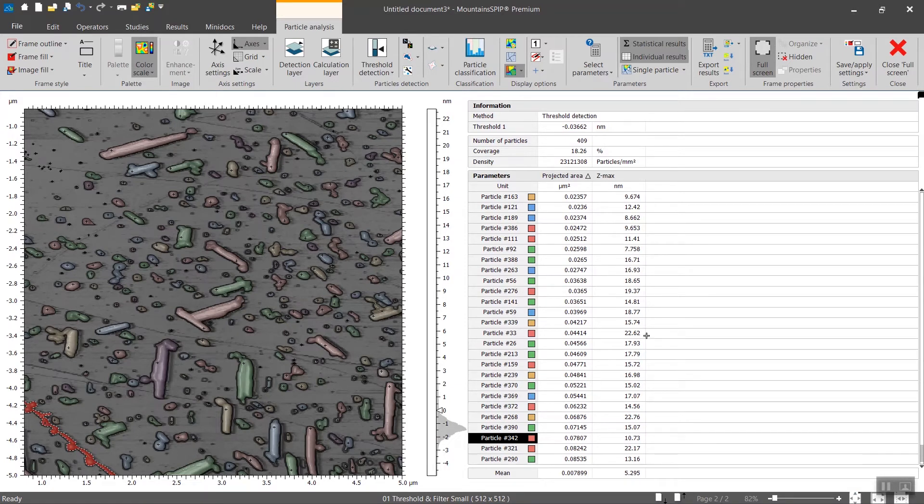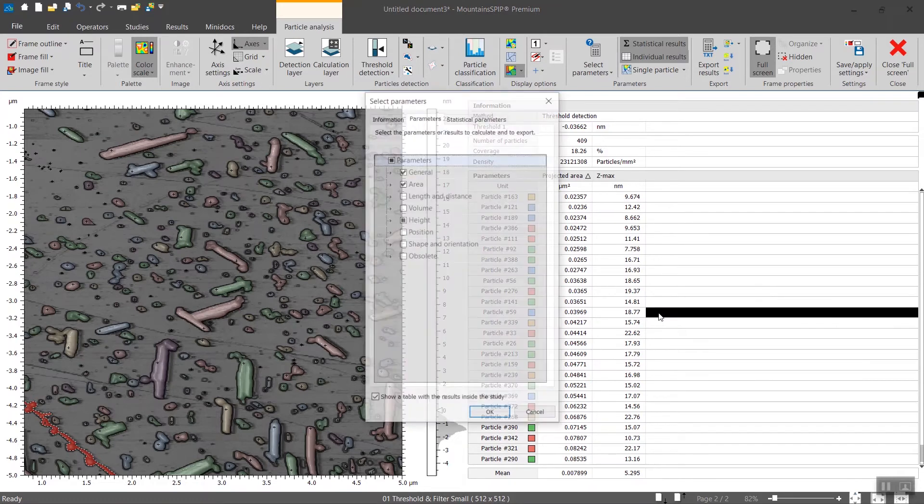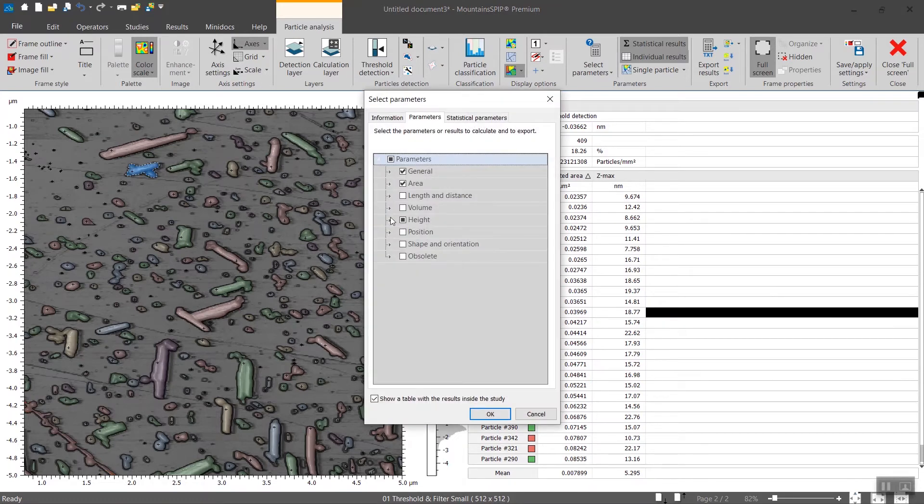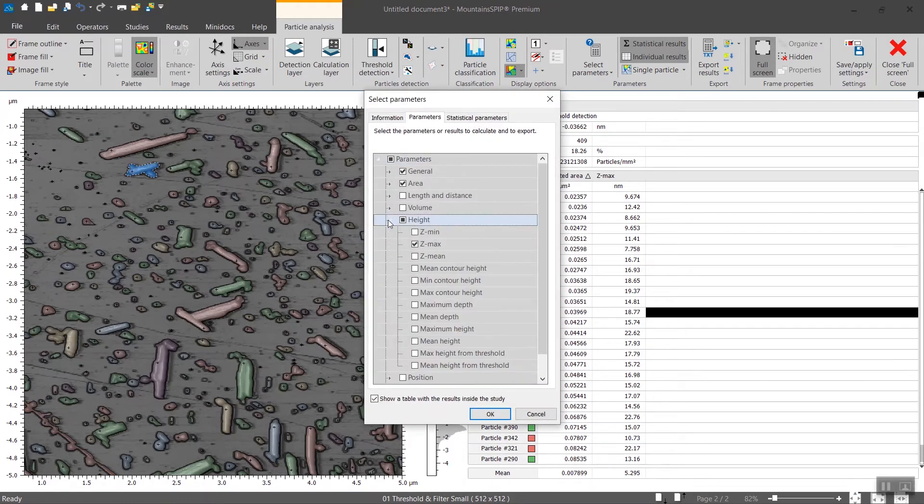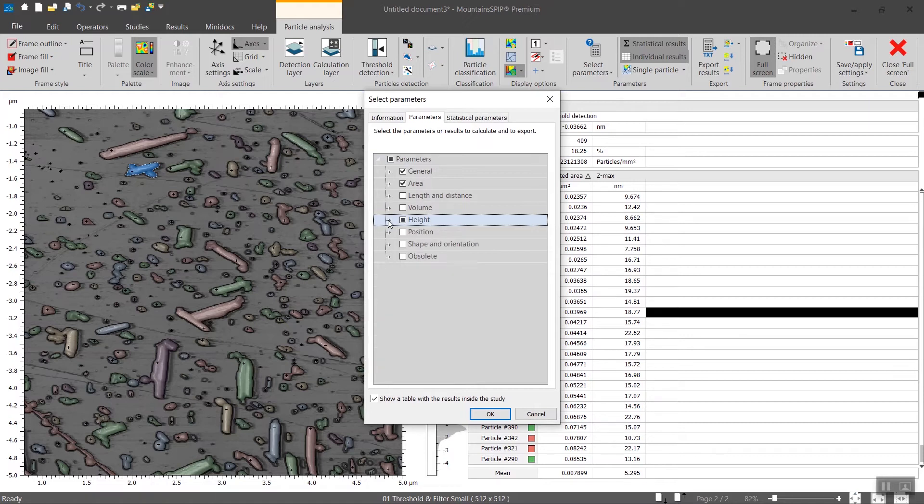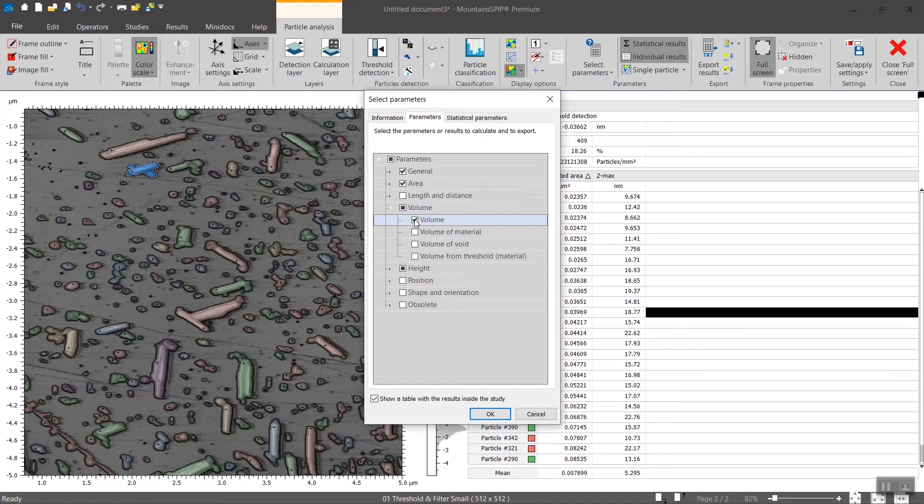You can double click directly in the table to be able to add or remove additional parameters. For instance, if you want to calculate the volume you simply do it like that and you click on OK.